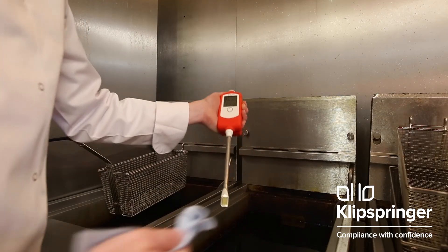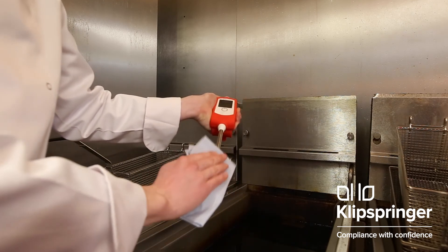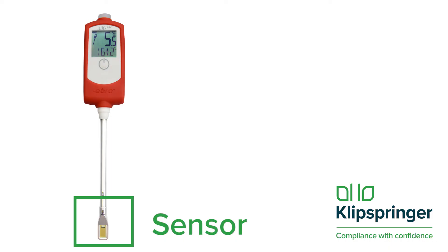Finally, you need to remove the sensor from the fryer and gently pat it dry using soft tissue or cleaning cloth. Careful — the sensor will be hot. Also, take care not to scratch the sensor. This is the brains of the instrument and needs looking after.